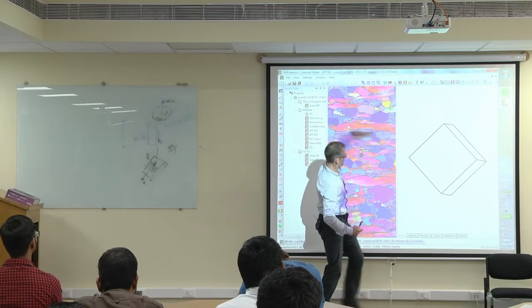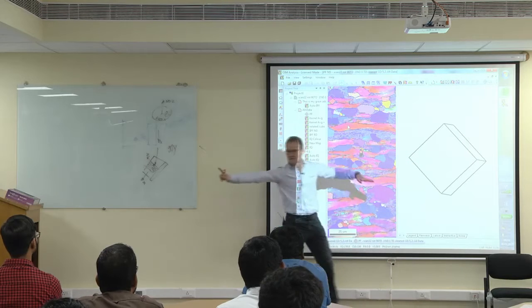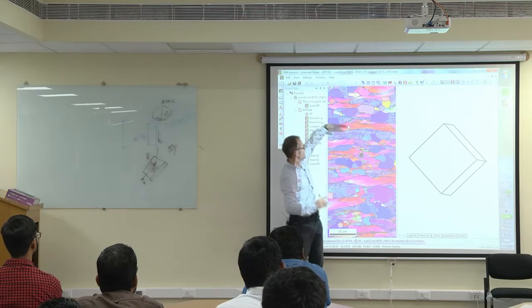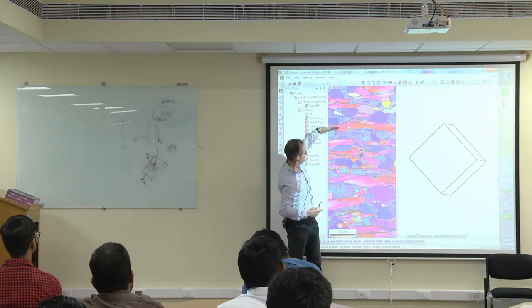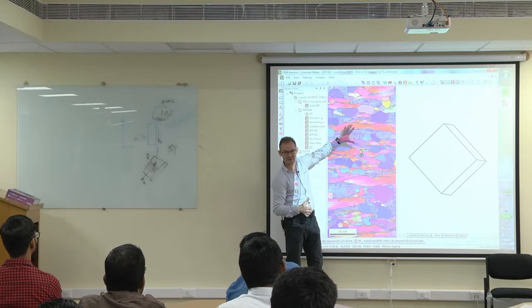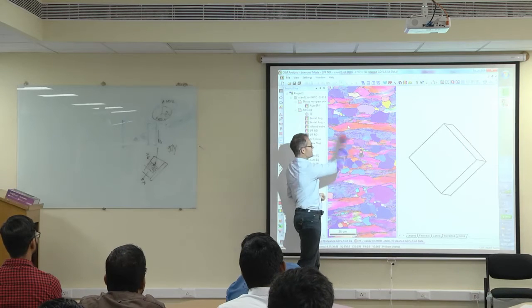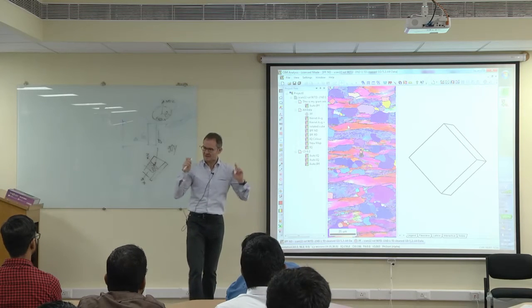Can I see that? Where is it? Oh, this is close to 111 here. No? Wrong, because it has been rotated, this thing here. There's no longer this view here. So if I want to measure this boundary, where is it? Then I need to rotate back and must come to the original orientation where I see this picture like I see the crystals. And that creates really confusion.